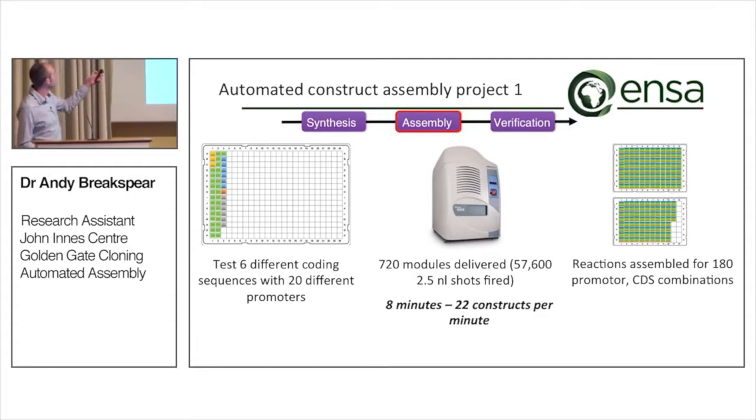So here's what we'd get out of the Echo, the destination plate containing bespoke mixtures in each of these destination wells.